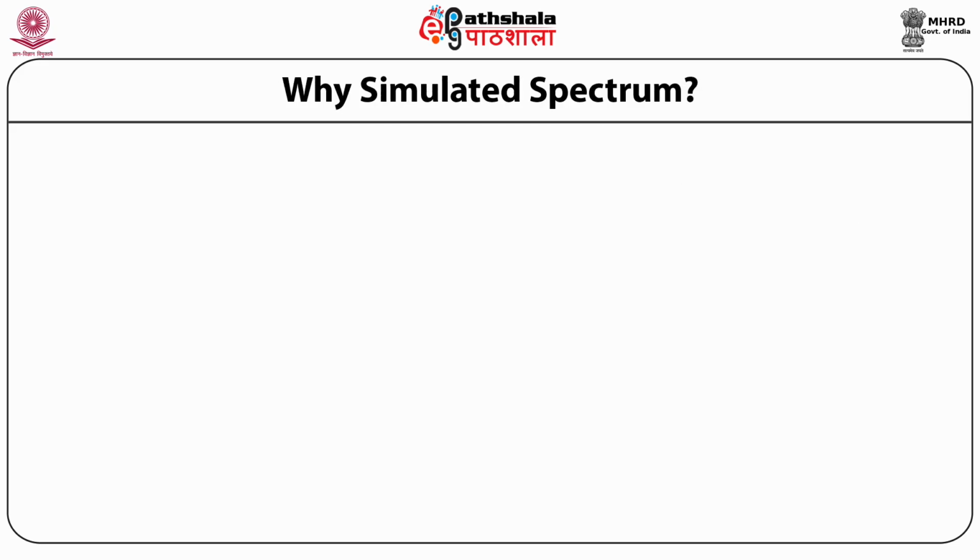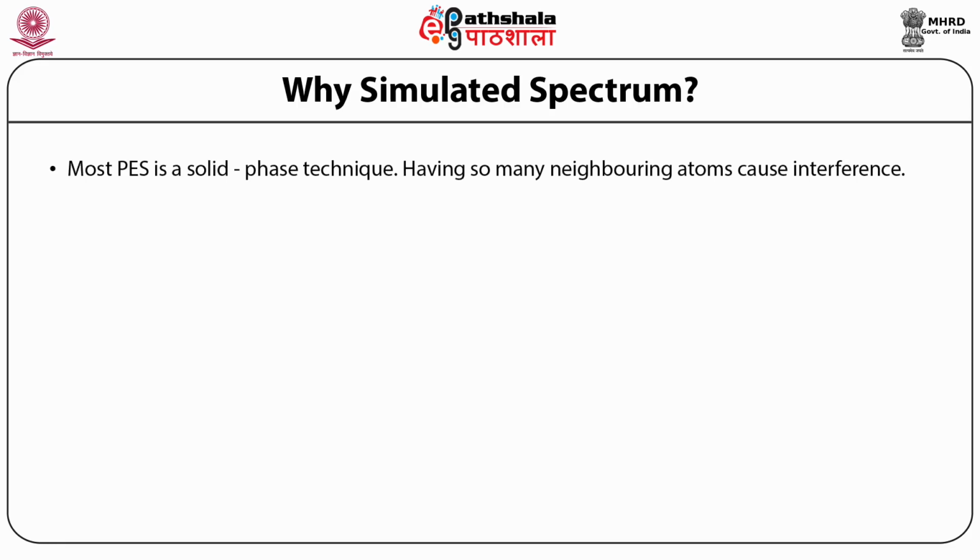Now let us talk about why a simulated spectrum. Where is the necessity to have a simulated spectrum? Most photoelectron spectroscopy is a solid phase technique. Having so many neighboring atoms will cause interference.